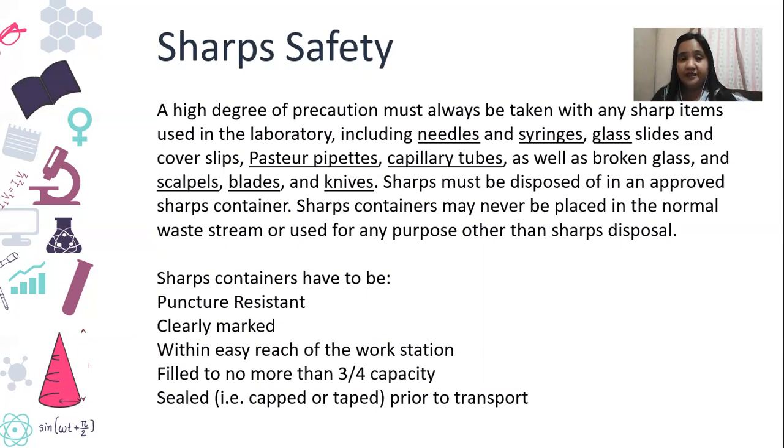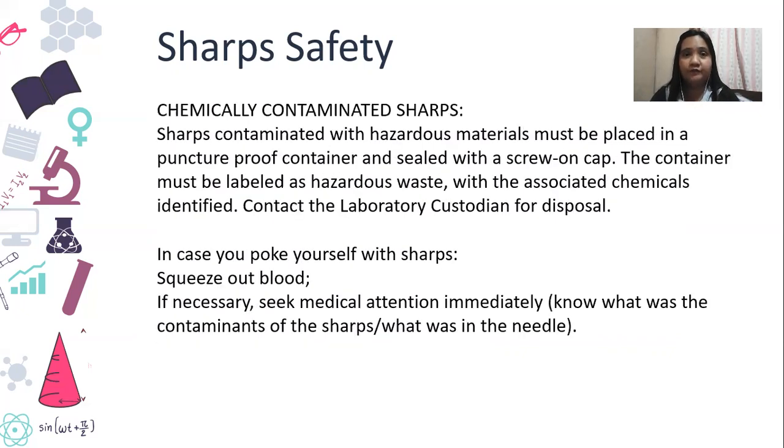It's clearly marked. It should be easy to reach, filled to no more than 3/4 capacity, and should be sealed. These are called "delikado" in our Filipino language because they might hurt you, they might puncture you. So those are the safety precautions in using sharps.